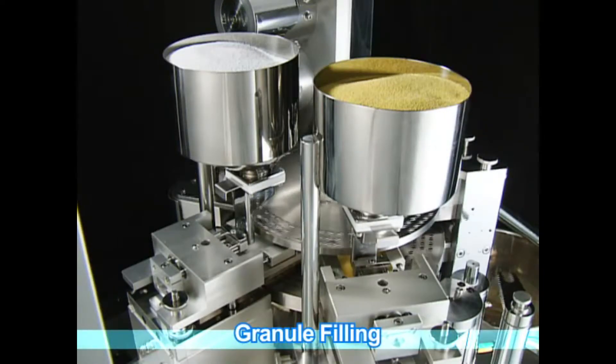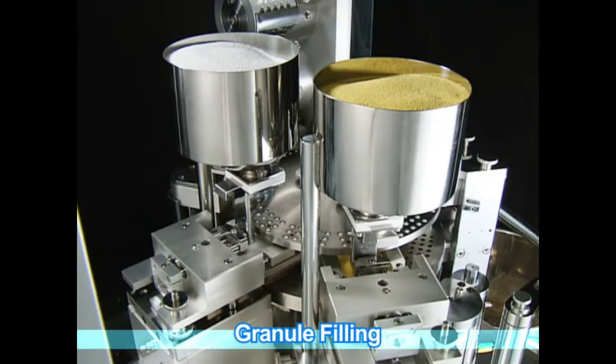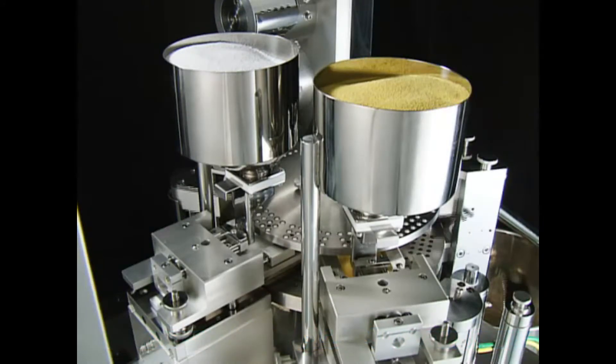An upper and lower measuring plate enable fine adjustment of the filling volume by the upper and lower shutters. This enables dual-stage filling with individual filling volume control.